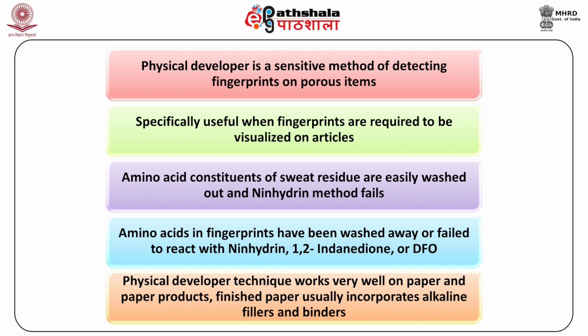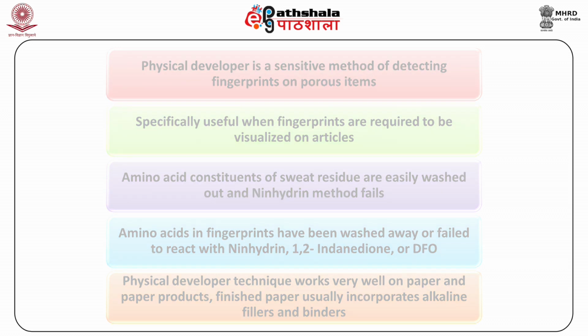Then we have learned that the physical developer technique works well on paper and on paper products. The finished paper usually incorporates alkaline fillers and binders. These react with the physical developer composition and alter the concentration of its ingredients.